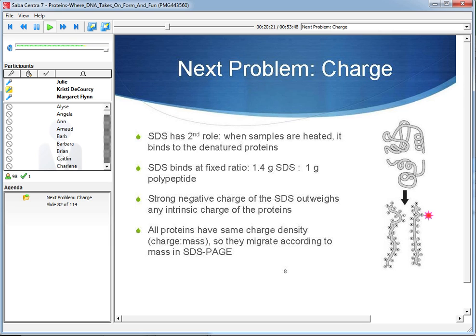One interesting thing about this is something that came out from a scientist named Laemmli. This paper came out in 1970, and that's where we get the name Laemmli sample buffer, because he developed this buffer. The paper he wrote was published in Nature, and it had something like 130,000 citations as of last time I looked. So it's definitely a commonly used technique.